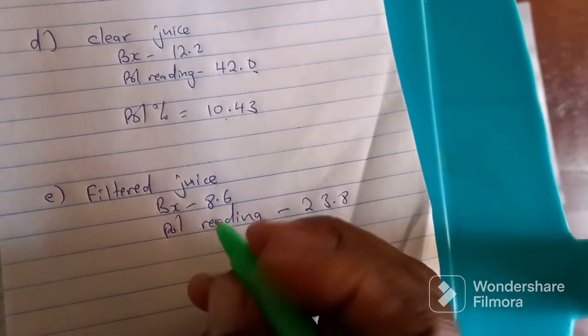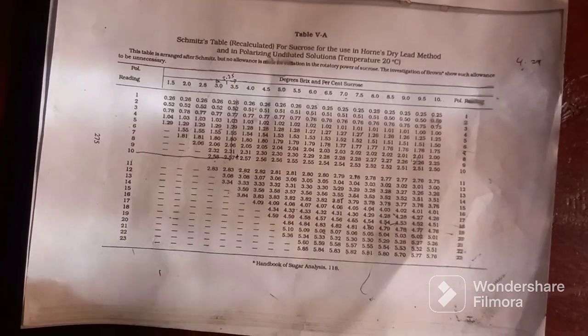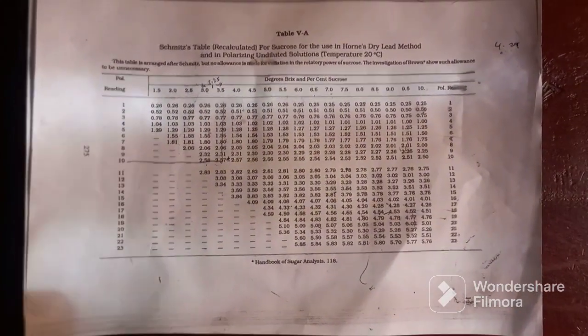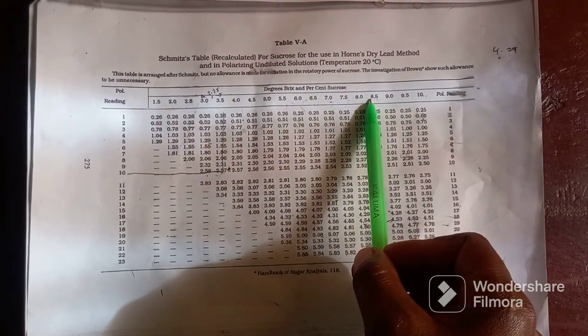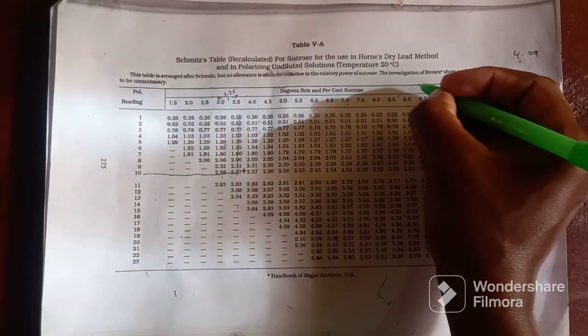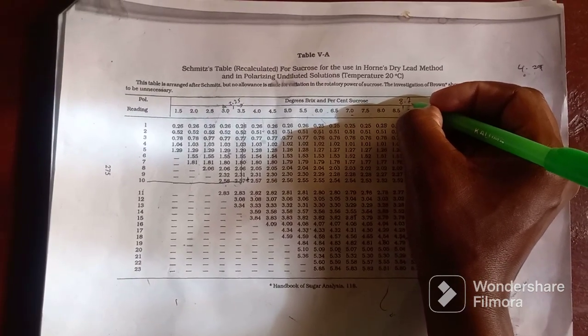We start with the first table. The highest Brix is 10, so 8.6 can lie in between these Brix, and pol reading, the highest is 23. So the first table will help us to get the pol percent of filtered juice. So let's see where 8.6 lies. It's between 8.5 and 9.0, and in between 8.5 and 9.0, the value between is 8.75.